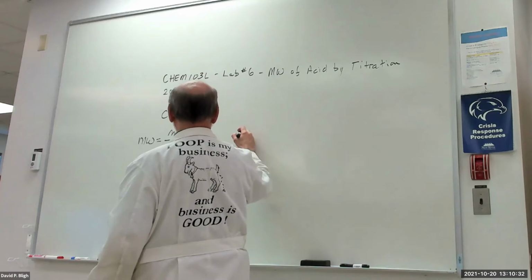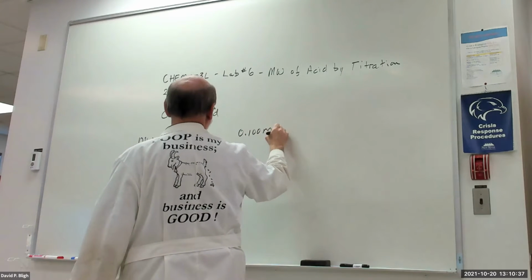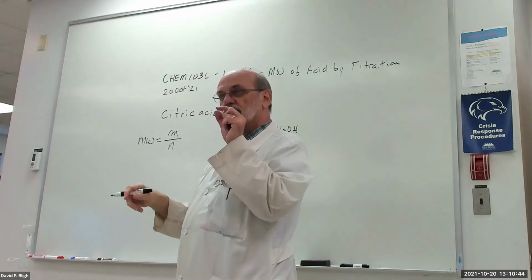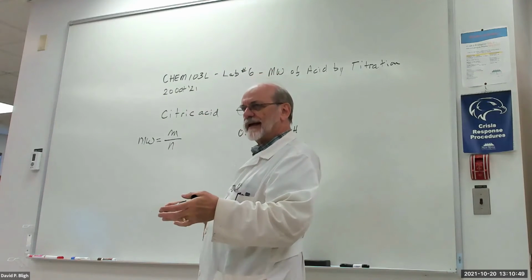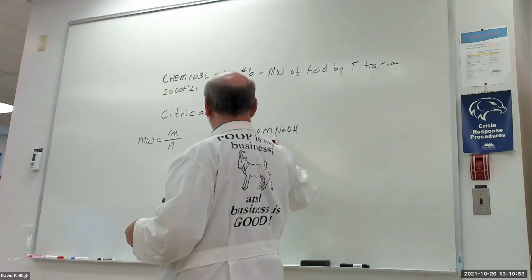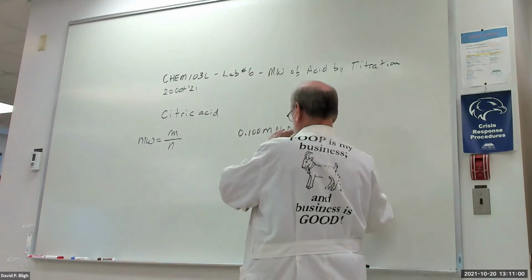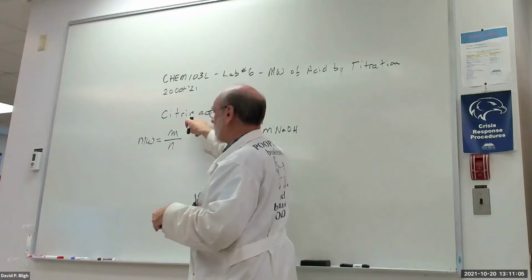So we'll have a known concentration. Let's just, for argument's sake, say it's 1 molar sodium hydroxide. So you can titrate the base with the acid, and you find out the equivalence point. We're going to use phenolphthalein as an indicator. And you can determine when the number of equivalents of sodium hydroxide equals the number of equivalents of citric acid. And when you do that, you can relate to the number of moles that are actually over here.